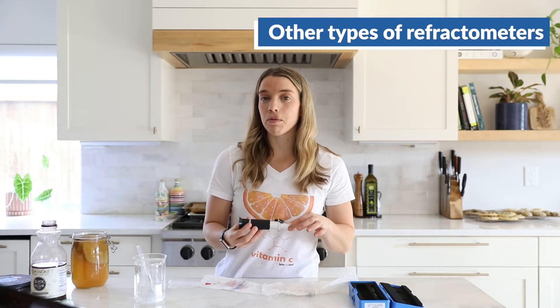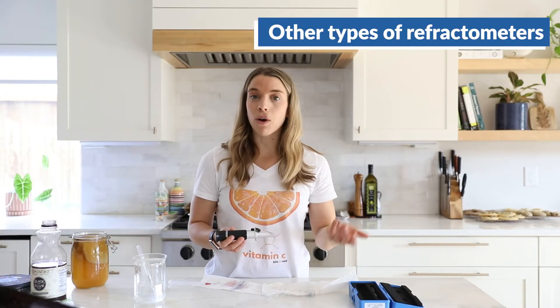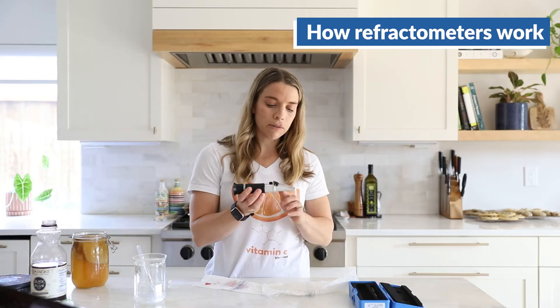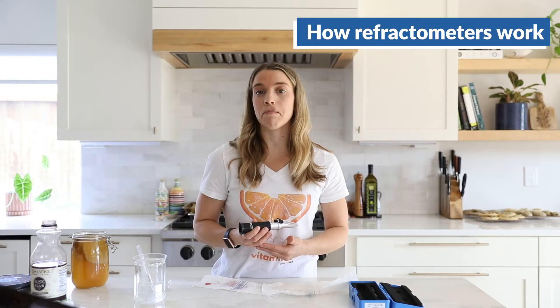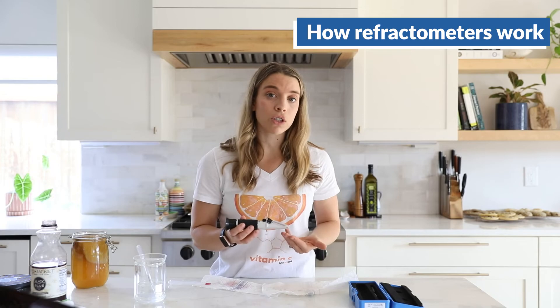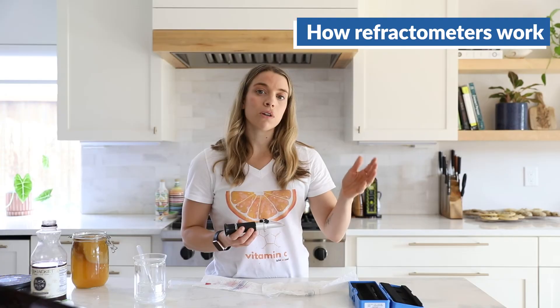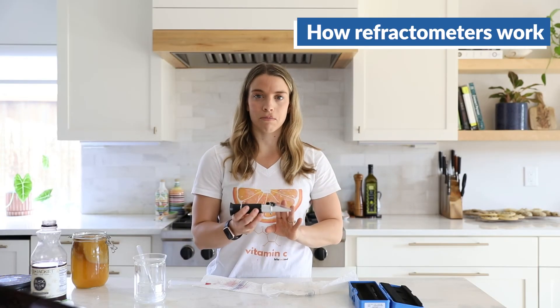We should note that this type of refractometer is a Brix one, meaning it measures sugar. There are other types that measure salt or other dissolved solids in solutions, and they all use the same principle: refraction, or the bending of light. Essentially, there's a prism inside, and when light hits it, it bends due to a difference in media. Depending on the amount of solids in the solution, you'll see different amounts of bending — more solids means more bending, and that's what the device is actually measuring.